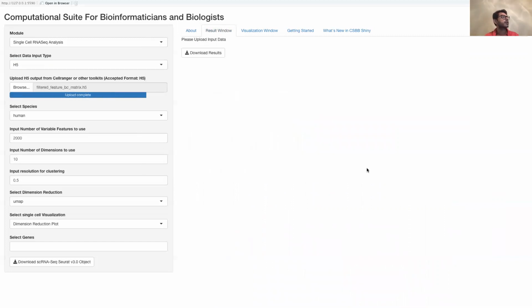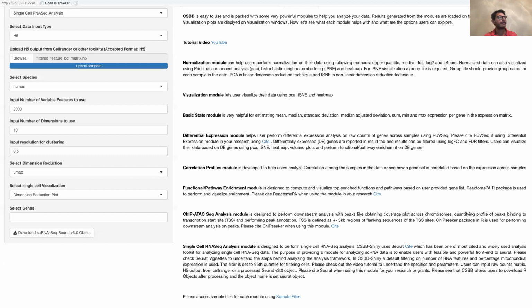Once it has uploaded, I can see on my screen that it's doing all these things, scaling the matrix, normalizing it, and so on. And I can go to the get started page, where I have mentioned everything that I was talking about.